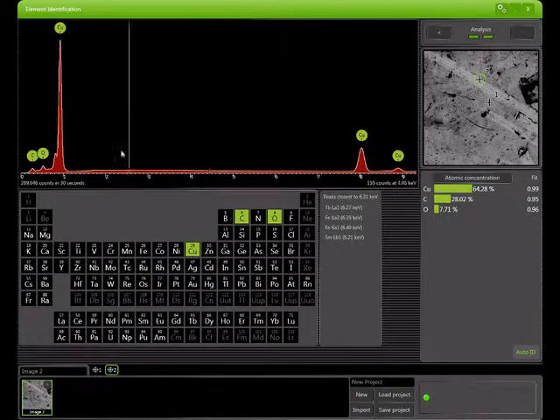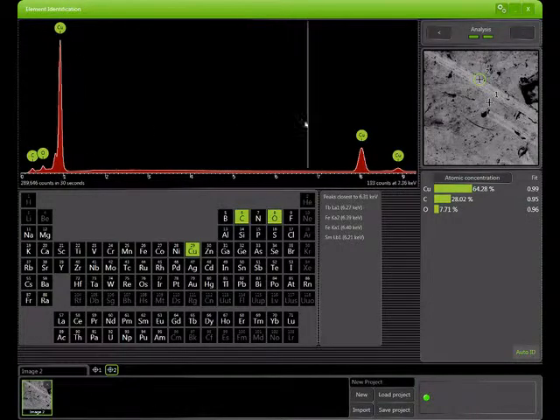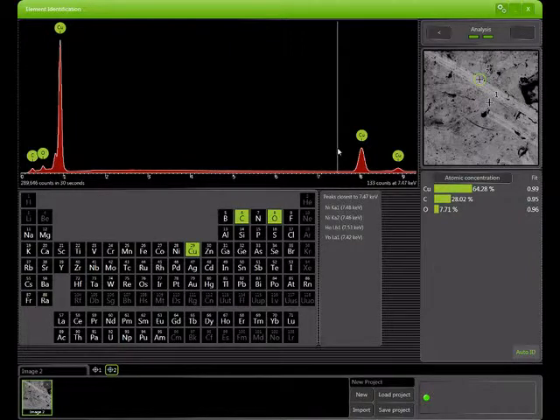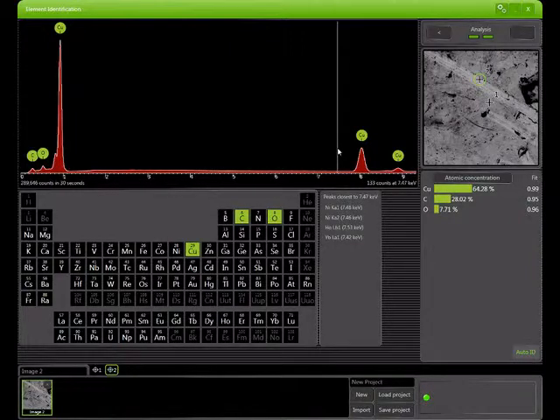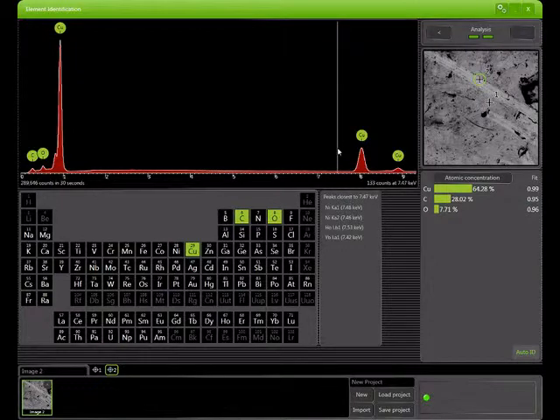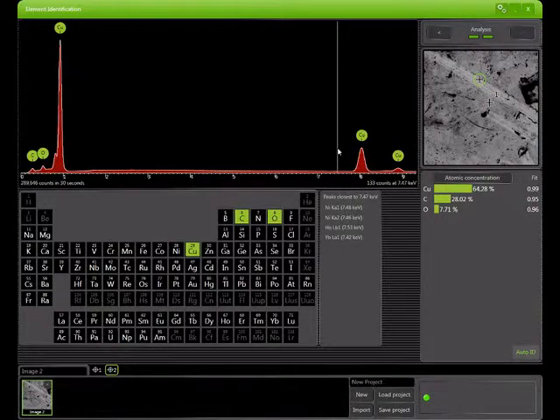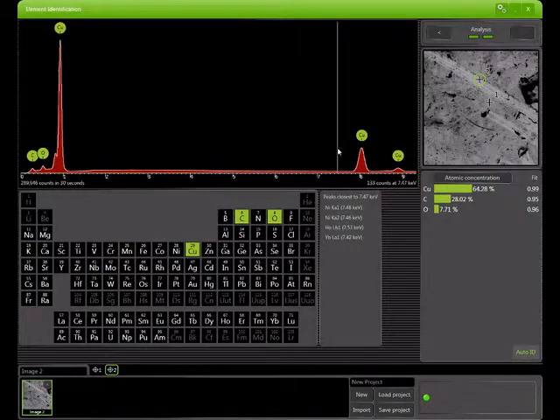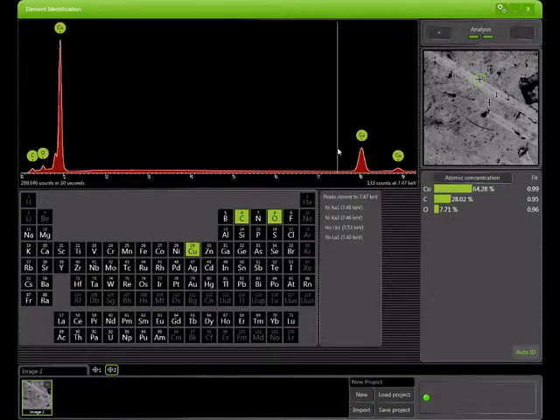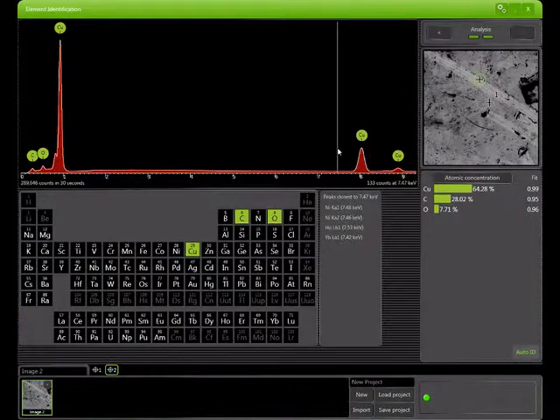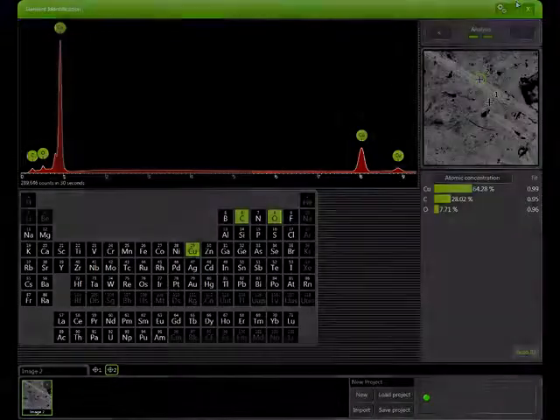But again, you can see that we're now seeing through that surface contamination at what is underneath. And this is an important consideration when you're doing analyses. What you're getting is the surface. If there is some contamination or a thin layer on the surface, that will affect your results. And since it is at the surface, it can affect your results more than you would expect because it doesn't have to get through any sample to get out. It's already at the surface.